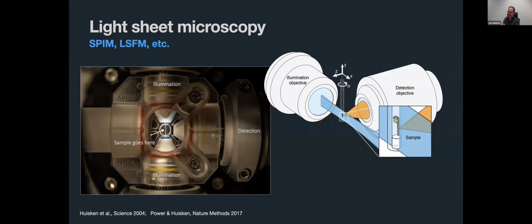On a lot of microscopes, you have this challenge that people come, they start an experiment, and light sheet is very, very dangerous, because you can image a specimen every 5 seconds from 4 directions for 24 hours, and then boom, you have 20 terabytes and you don't know what to do with it. And nobody can use the microscope until the data has been moved somewhere.